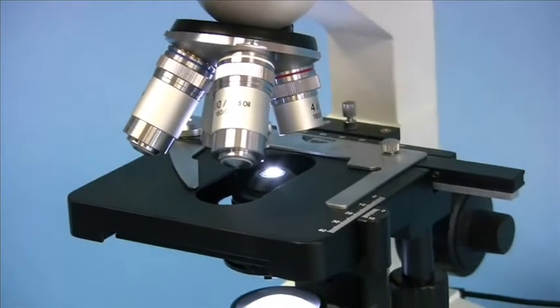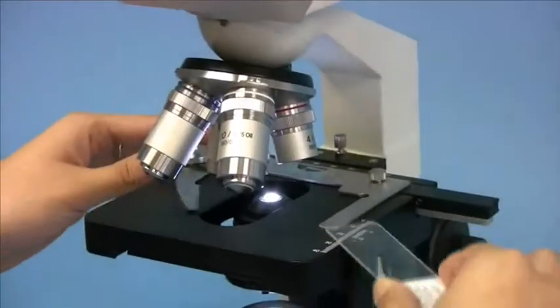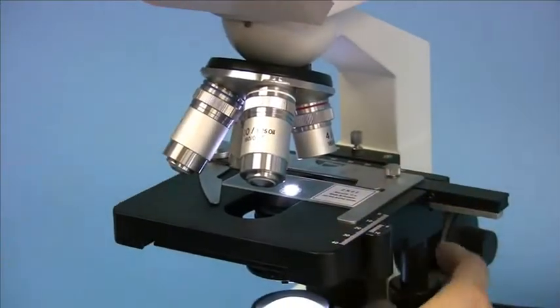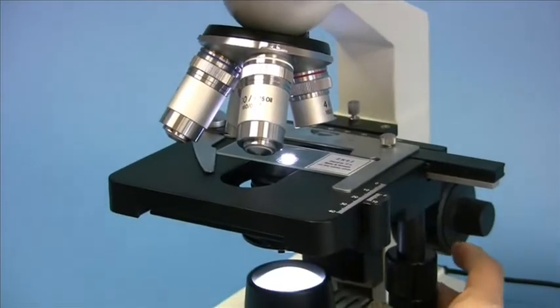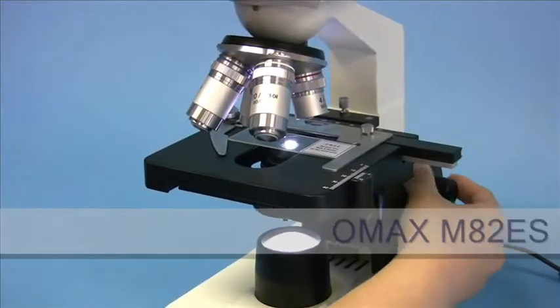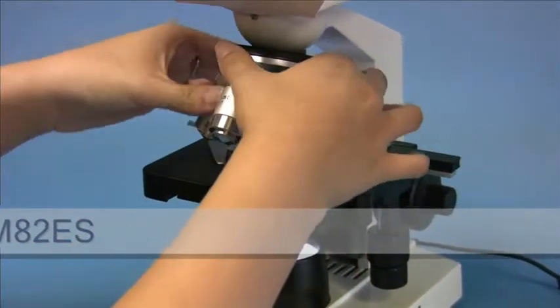So now, I'll demonstrate using this slide. So you simply put the slide on the stage, adjust the stage using the double layer mechanical stage, and the coarse and fine focus adjustment knob.